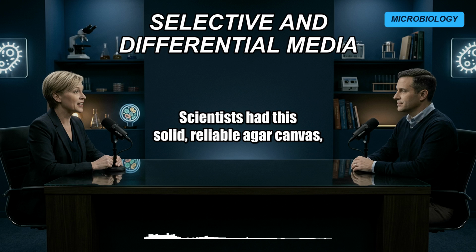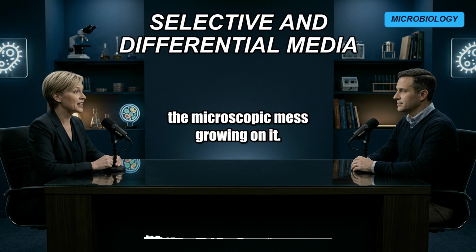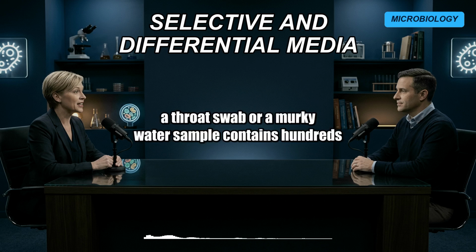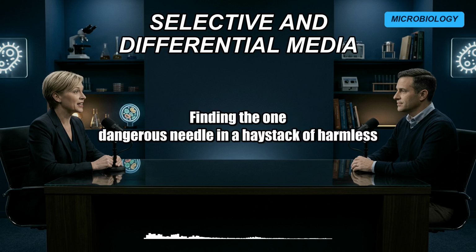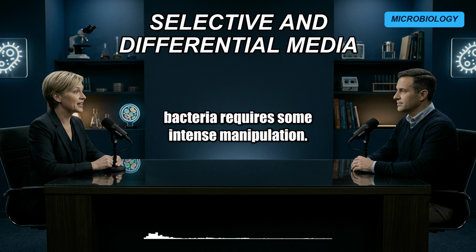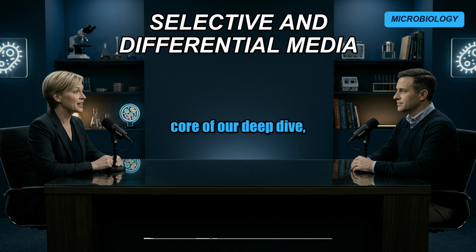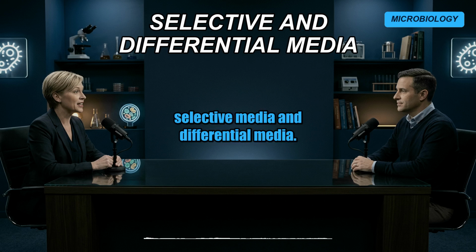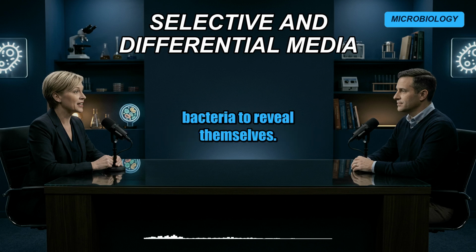Scientists had this solid, reliable agar canvas, but they still had to figure out how to sort the microscopic mess growing on it. I mean, a throat swab or a murky water sample contains hundreds of different types of microbes. Thousands easily. Right. Finding the one dangerous needle in a haystack of harmless bacteria requires some intense manipulation. And manipulating that agar is where we get to the core of our deep dive: selective media and differential media. These are the two primary strategies used to force the bacteria to reveal themselves.